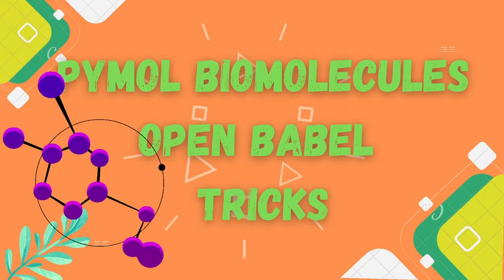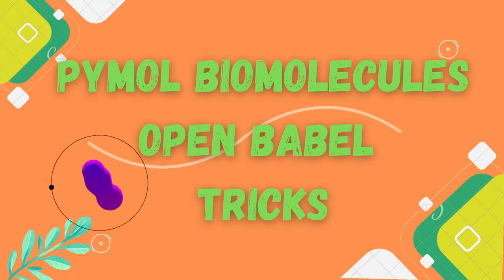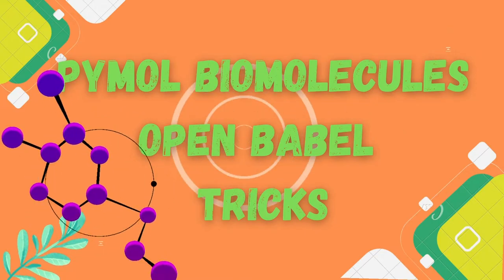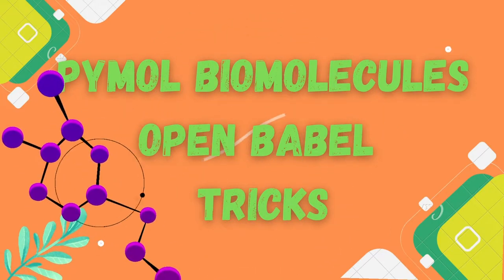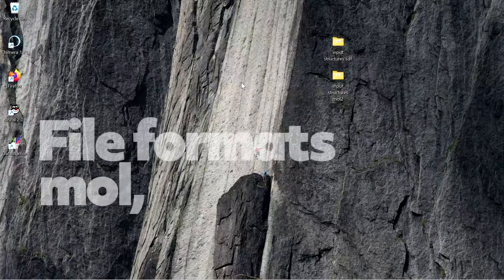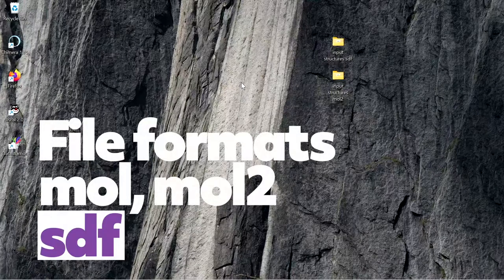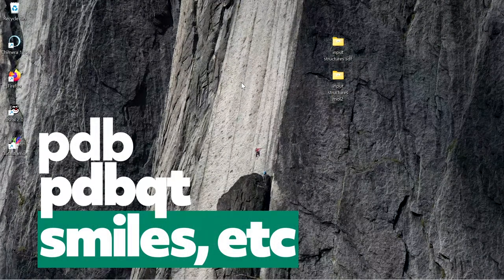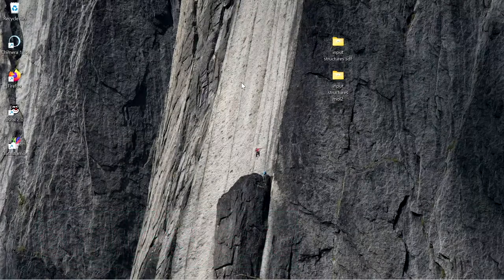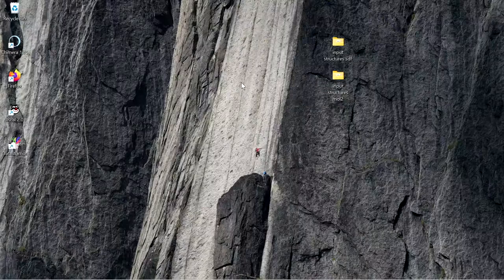Welcome everyone. In this video I am going to show you how to convert chemical structure files into different file formats. There are different file formats like mol, mol2, sdf, pdb, pdbqt, smiles, etc. We are going to see how to convert between the different file formats.